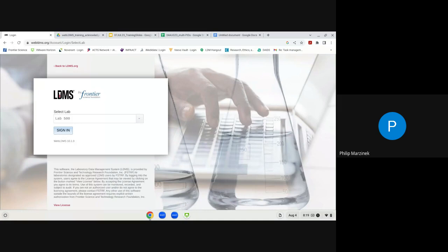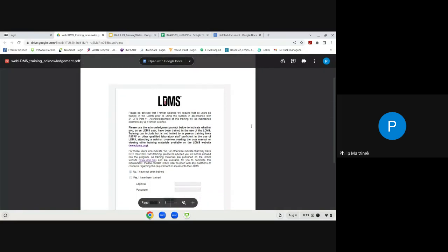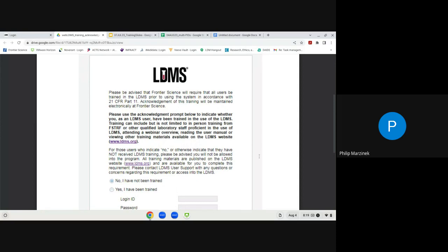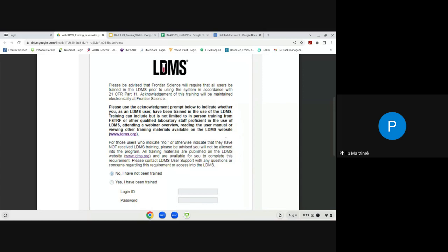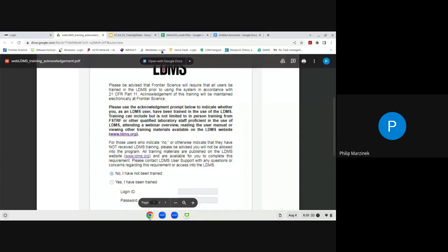Once logged in as a new user, you will be brought to the Training Acknowledgement Form. This form requires you to confirm that you have been trained on LDMS in some way — by attending a webinar like this one, reviewing previously recorded public-facing webinars, reviewing documentation or user manuals on ldms.org, or being trained by a team member. You will need to select Yes, re-enter your login ID and temporary password, and click Submit to reach the Web LDMS home page.